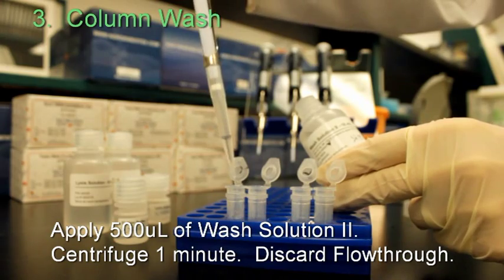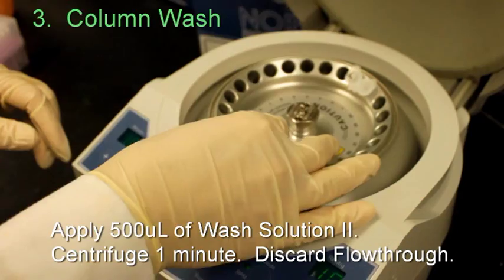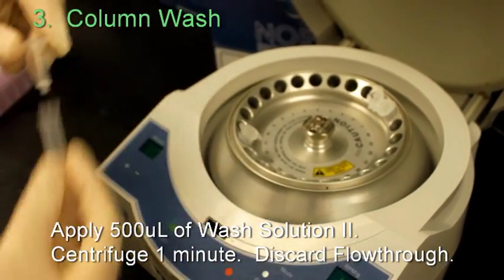Apply 500 microliters of WASH-2 to each column. Centrifuge for 1 minute and discard the flow-through.